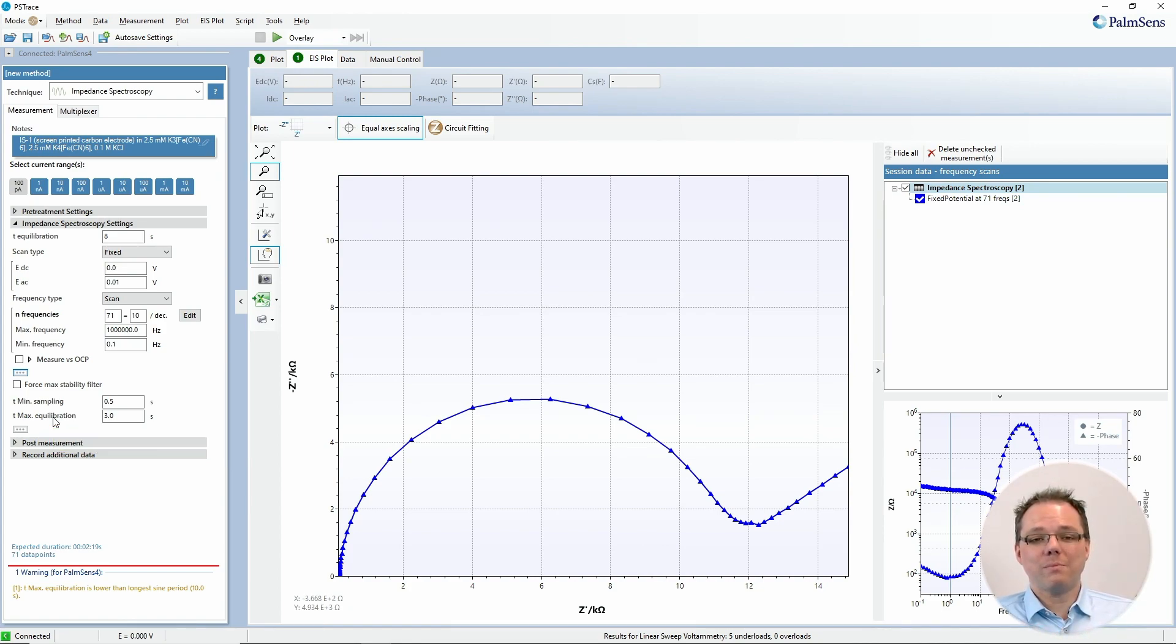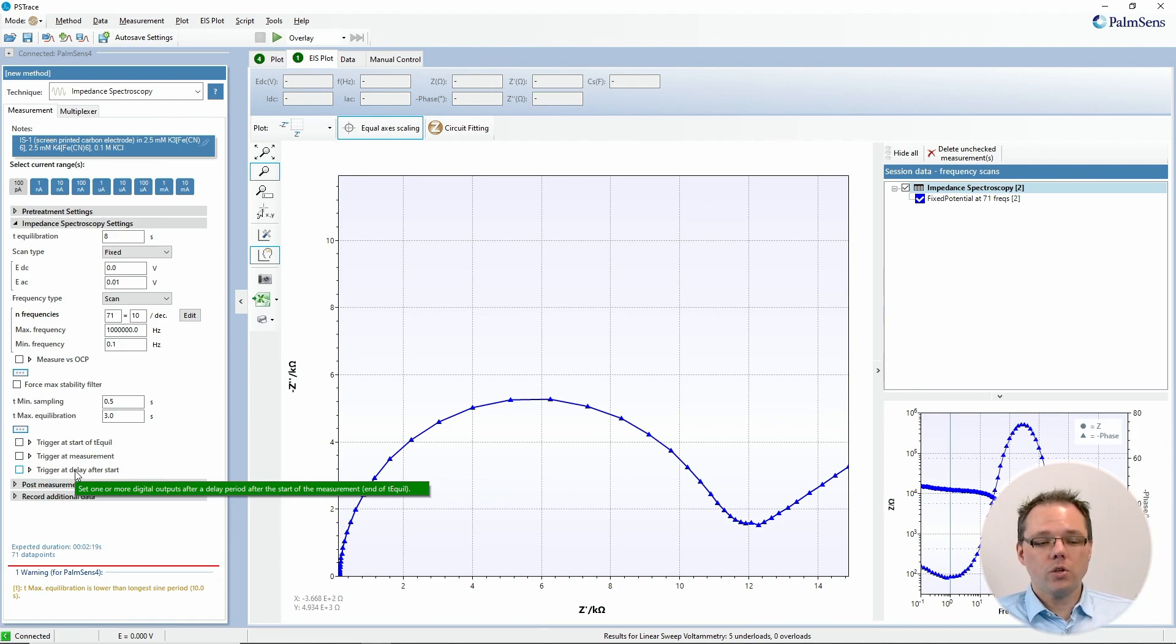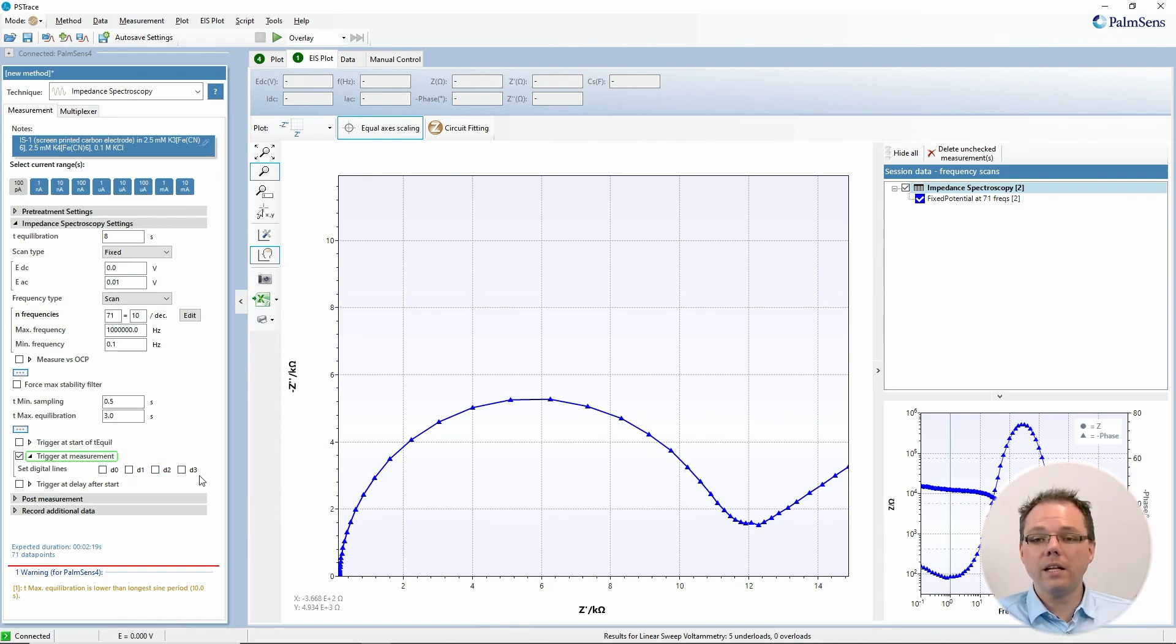The maximum equilibration time does the opposite. At very low frequencies measurements take very long, and usually we wait at least a full sine wave till we start recording values so the system has time to equilibrate. But at very low frequencies this can take very long and maybe you want to cut this short. The last advanced options are the trigger options. You can use the auxiliary port, so at the start of a measurement you can set the digital lines to certain values and connect to some kind of photodiode, spectrometer, or light source. This correlates your impedance measurement with the start of another external device.